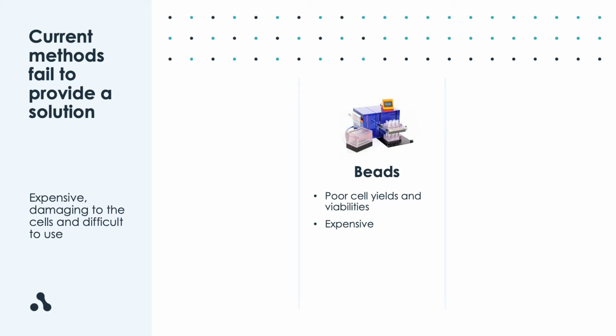An average bead run takes anywhere from 45 minutes to an hour. It requires quite a bit of hands-on time. And additionally to that, the ability to automate is very difficult due to the large number of steps and the high failure rates.